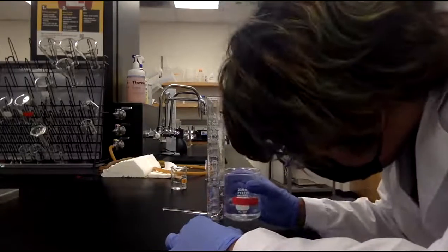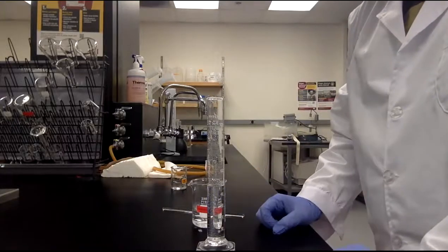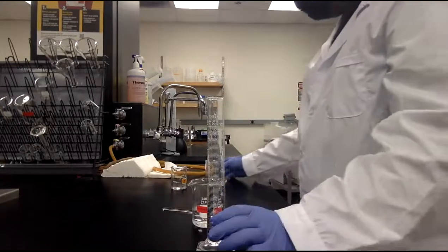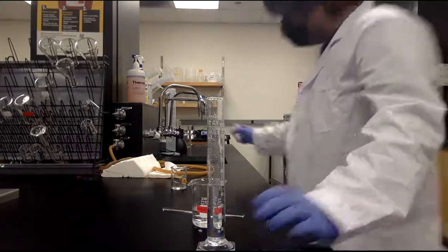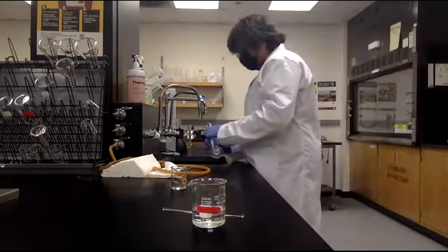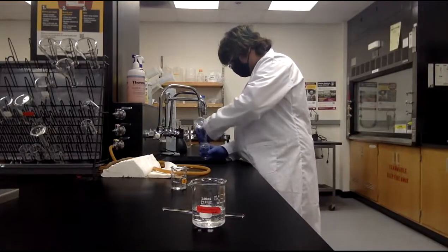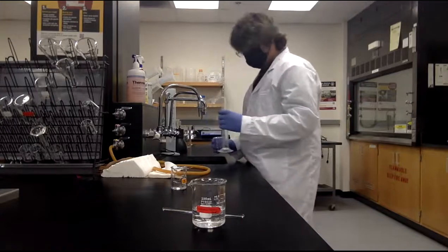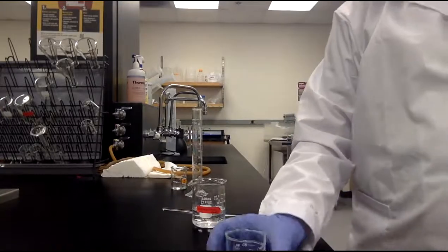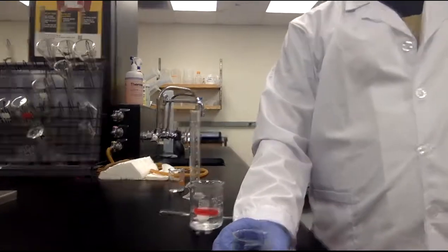All right. It's about 49. It's fine. Yeah. I think that's about 50. Now just pour it back to the beaker. That's for your first buffer. So that's our strong acid solution or weak acid solution. I'll do your second one.